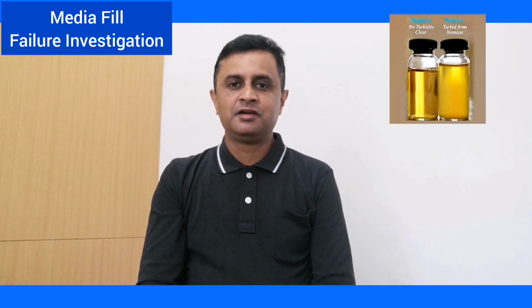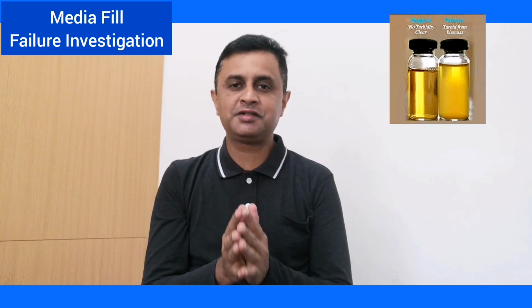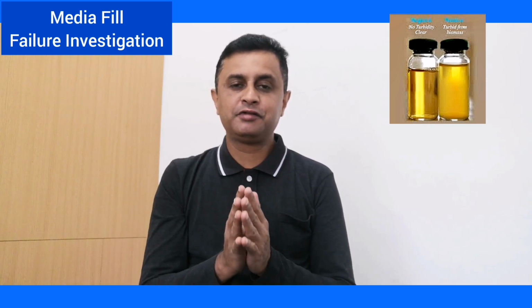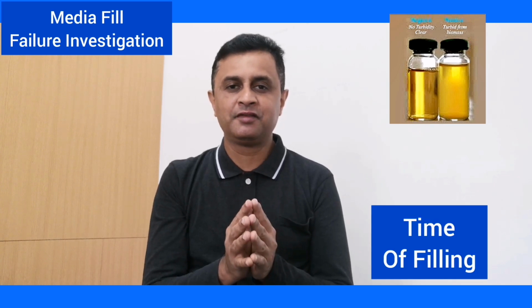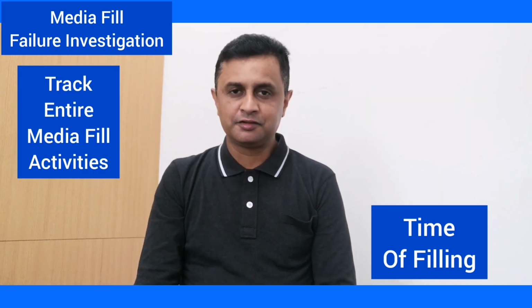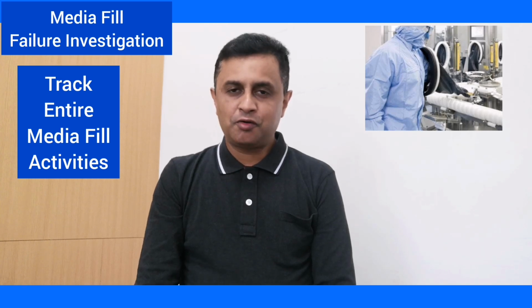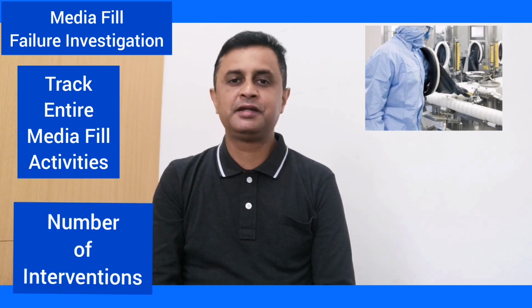First and foremost, the important part of investigating one or two contaminated units is to understand at exactly what time the failure occurred. For that we have to track the entire media fill activity, right from the beginning of the assembling activity throughout the filling: what the interventions were, how we filled, how many people were involved.